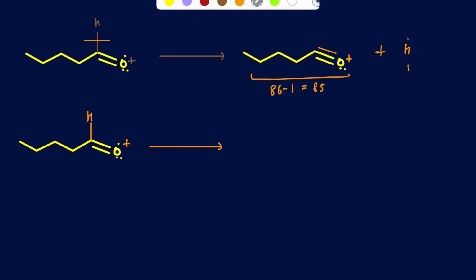So if I do the fragmentation right here, so then I'm going to count 1, 2, 3, 4. The radical I'm going to make would be this one right there. And obviously, remember, I can also make a carbocation out of this, but that is not going to be a very stable carbocation. And then I'm going to be making an acylium ion here. That would be just a hydrogen, carbon with a triple bond, and an oxygen there with a lone pair. So then this is C4H9. So that would be 57. So that's a loss of 57.